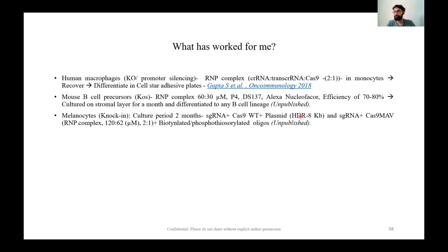But remember, you will have to evaluate, let's say, if you want to include certain markers or not. I did, it worked, but you really have to make sure that your efficiency is high for insertion. And you can compromise the viability on that if you increase the transfection efficiency, which is assessed just 48 hours after transfection. The second that worked for me was the single guide RNA Cas9 monoavidin and tagging of oligos for a base edit in primary melanocytes.